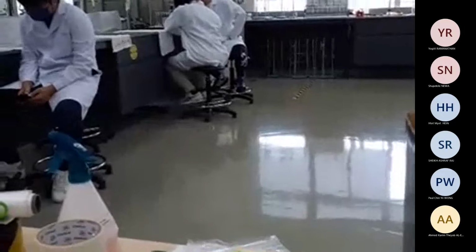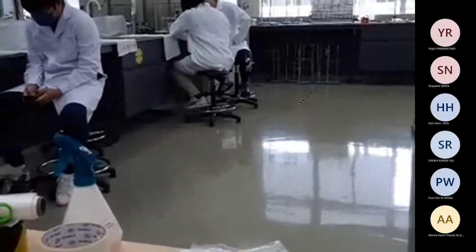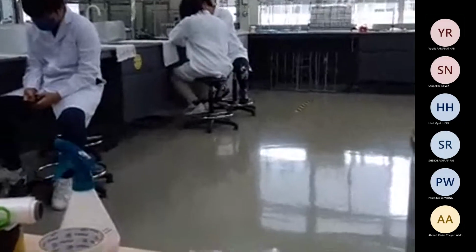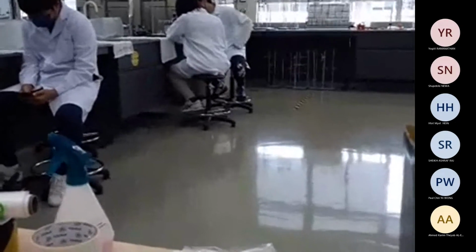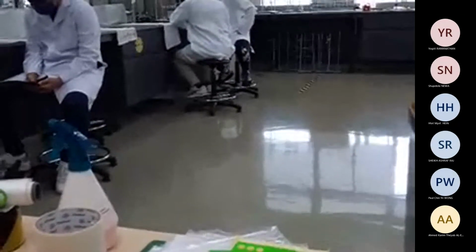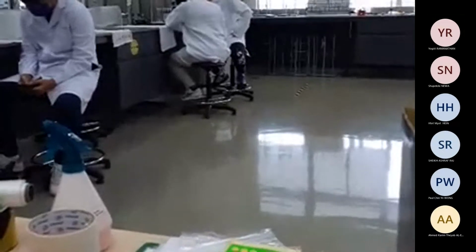So based on these, we will find the concentration of how much sodium salicylate is there. If we know the concentration of ferric chloride, then we will also be able to know how much sodium salicylate was added there, right? So for the preparation, we will fill up with 150 ppm. What does ppm mean?